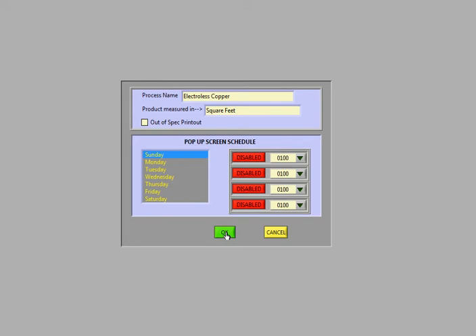So it's very nice for calculating your analysis events to have this kind of work week schedule that you know for sure that the same number of hours have elapsed between each analysis period versus having your analysis just on Tuesdays and Thursdays or Tuesdays and Fridays. That will always create a different gap between processes.